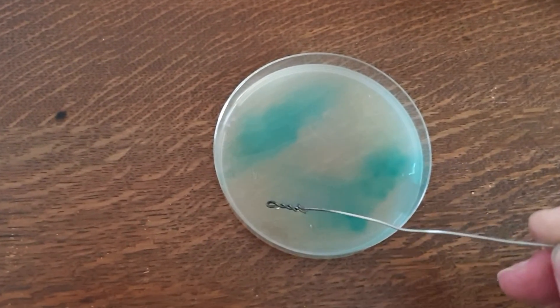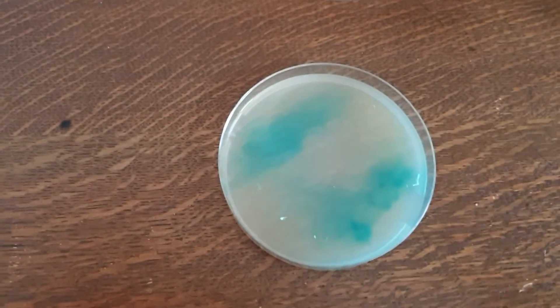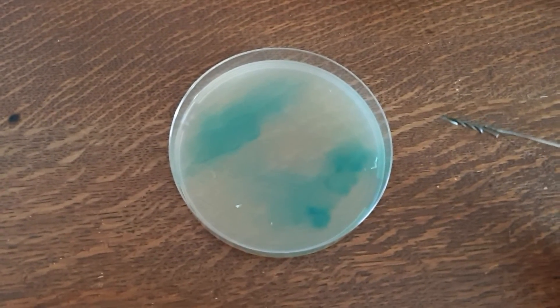Then you can get your scalpel, cut a little sample after it's grown for a little while, fish it out, pop it into a new agar plate — and Bob's your uncle. You have a much cleaner mycelium sample. Away you go.